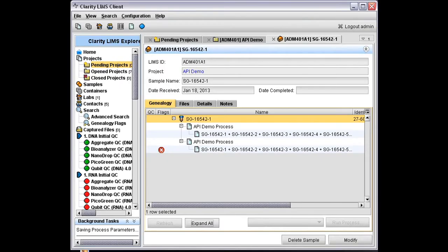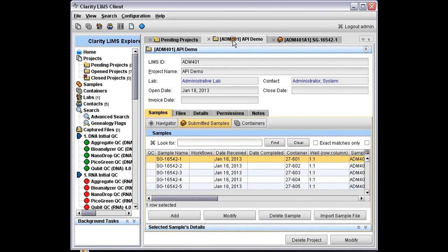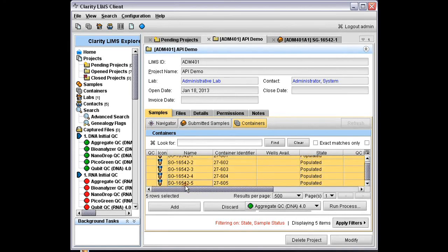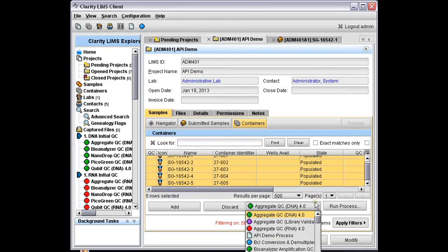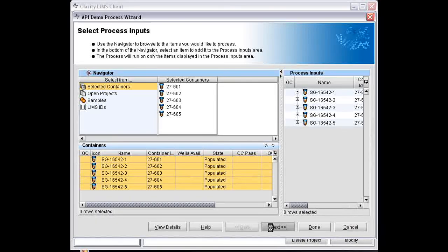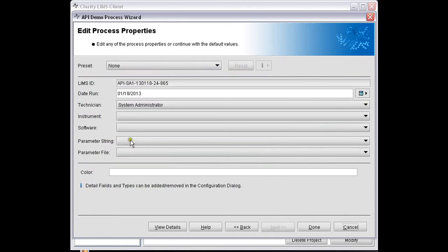So we'll save our changes and we can go back and run this again. Remember to pick parm2.